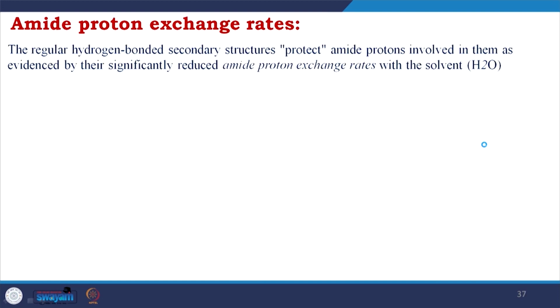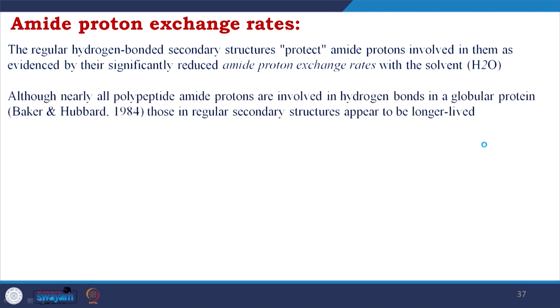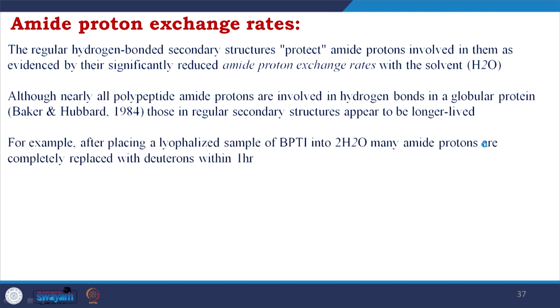Amide proton exchange rates, which we are talking about, are also important. The regular hydrogen bonded secondary structure protects amide protons involved in them, as evidenced by their significantly reduced amide proton exchange rates with the solvent. Although nearly all polypeptide amide protons are involved in hydrogen bonds in a globular protein, those in regular secondary structures appear to be longer lived. For example, after placing a lyophilized sample of BPTI, bovine pancreatic trypsin inhibitor, into water, many amide protons are completely replaced with deuterium. So here you use deuterium labeled water.